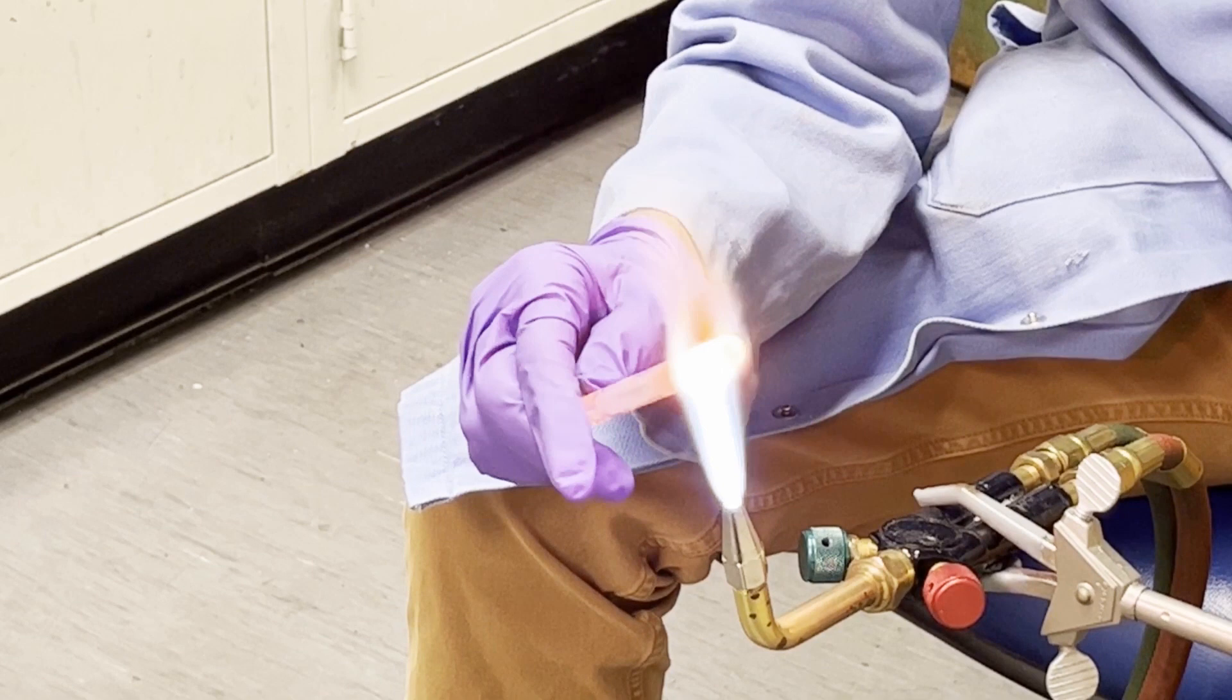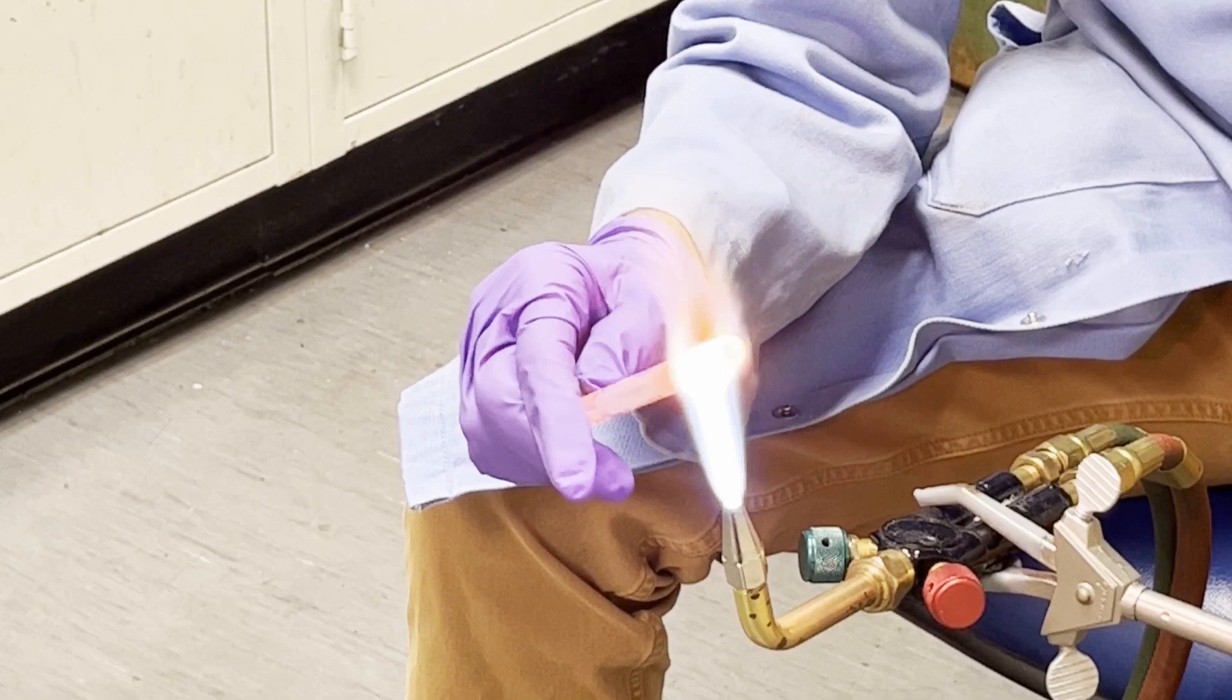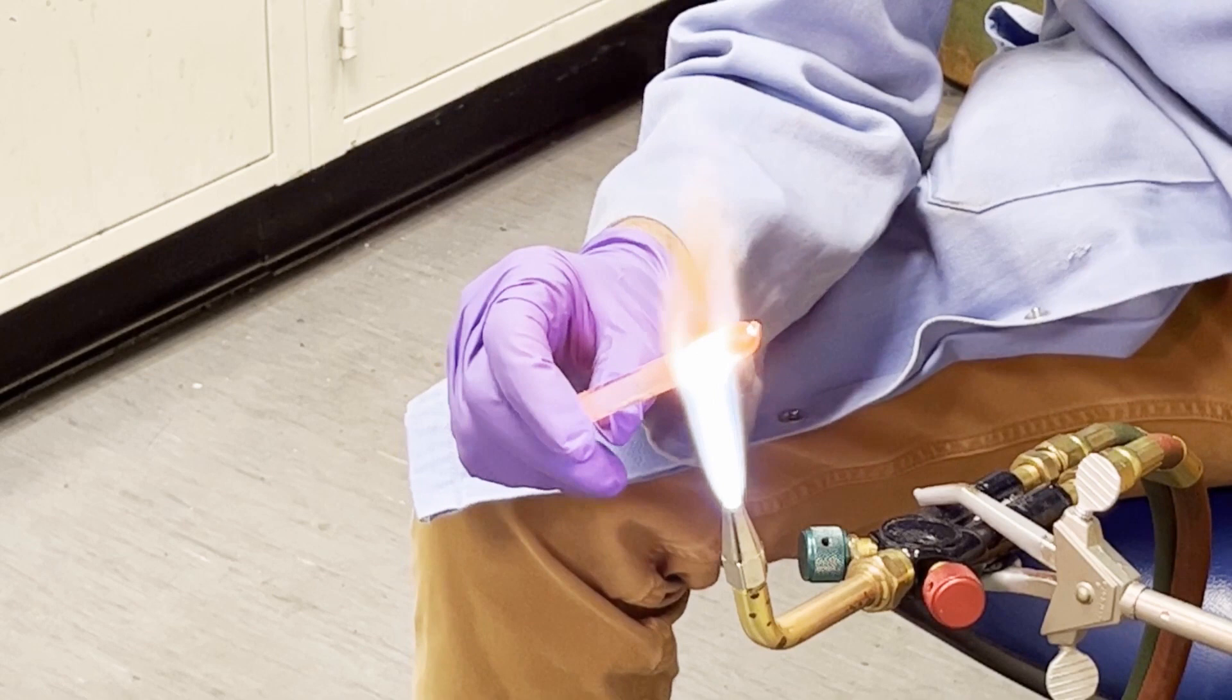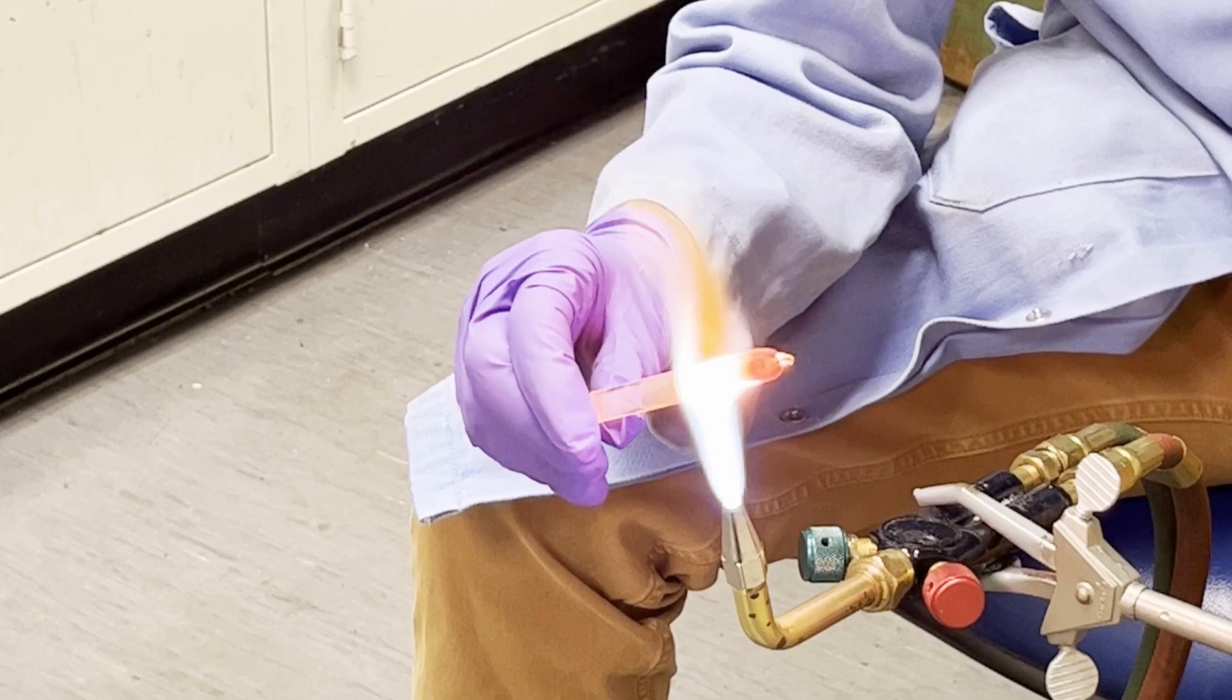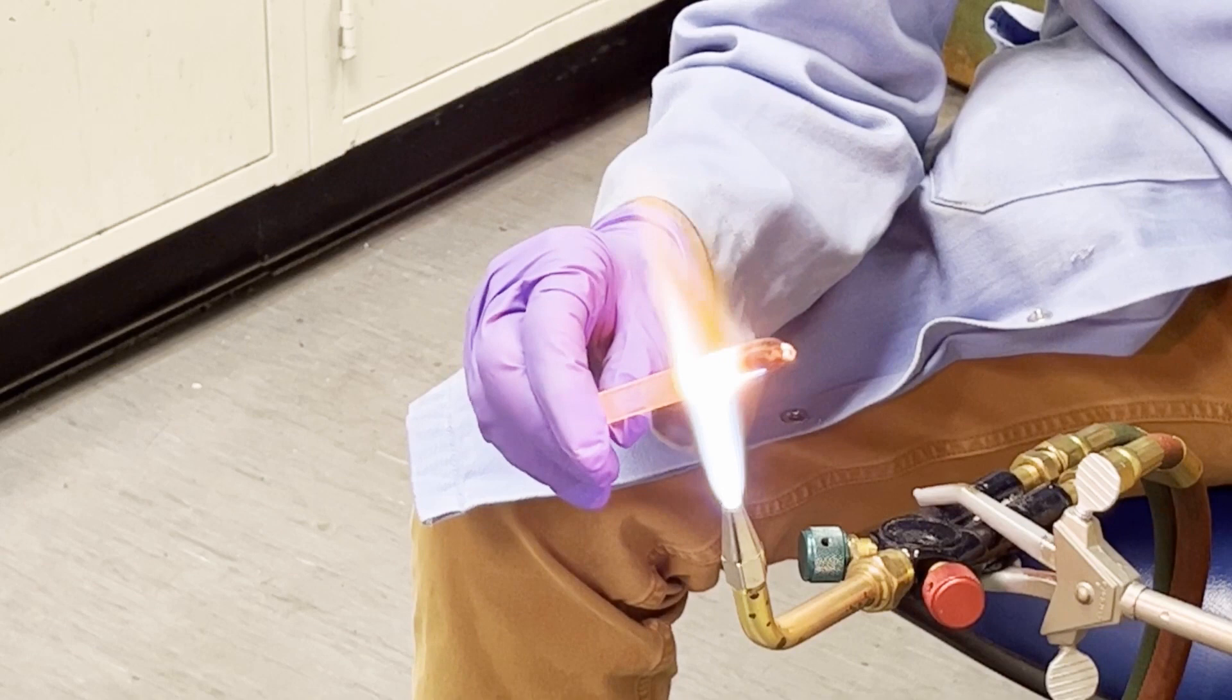You can carbon coat as high up the tube wall as you want, but if you have too much carbon that's going to get in the way of your sealing, so it's going to prevent you from getting a good seal. Really, you only need to carbon coat as high up the walls as you think your material is going to reach.